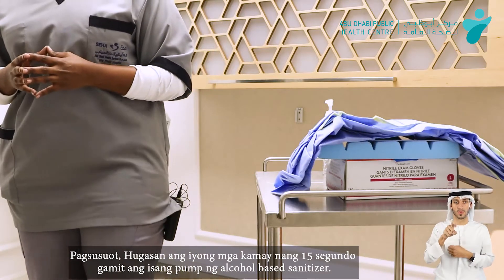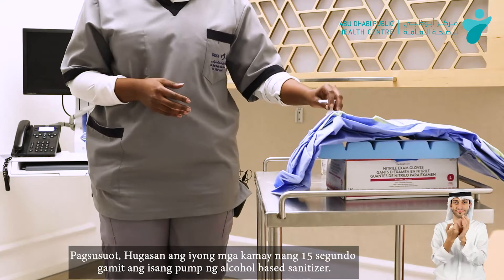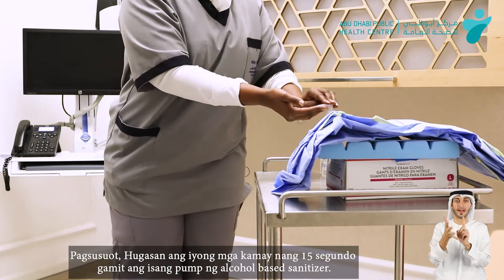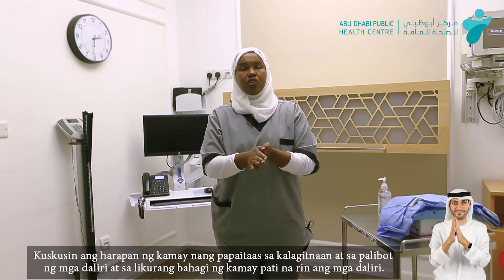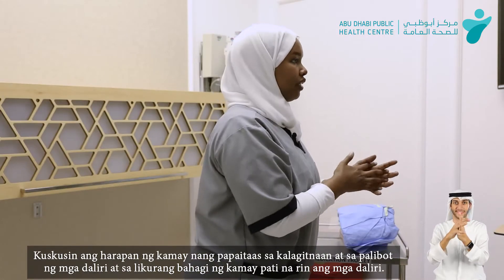The donning process will start with, of course, hand hygiene. We'll use the hand wrap, one to two pumps. We'll start wrapping using palm to palm, back, and in between the fingers.